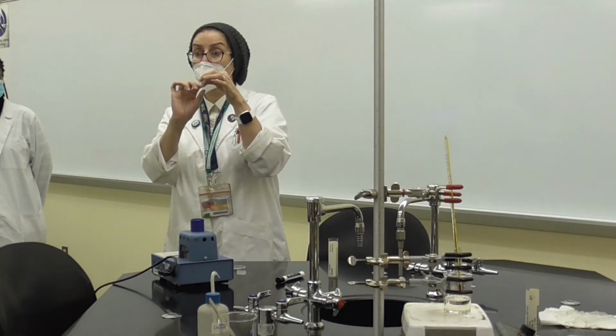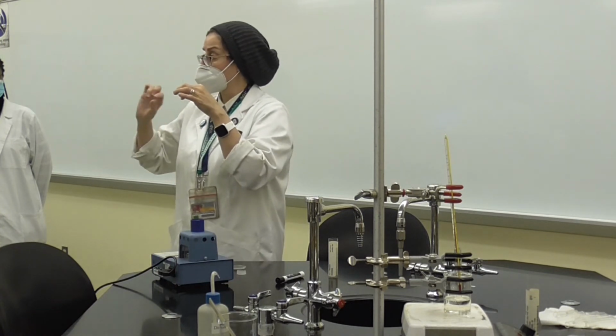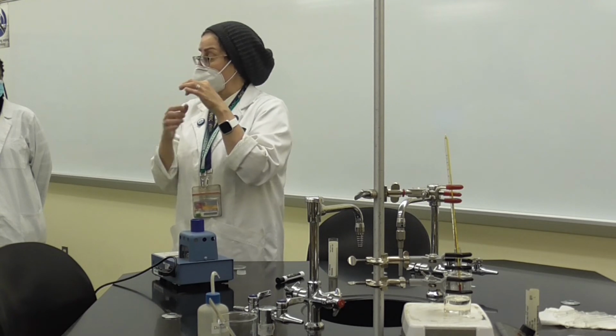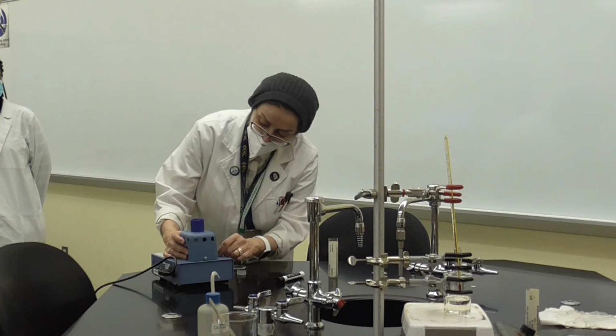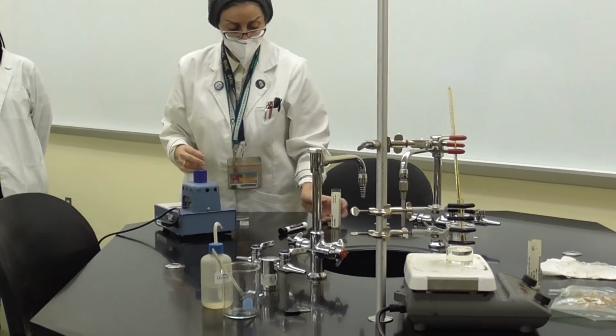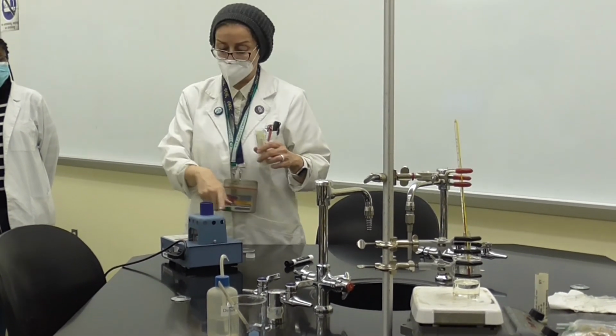You don't want it too high. In other words, you don't pack it with more than 1 or 2 millimeters of the powder. And then we are going to insert it here. There are 2 compartments, so you can prepare 2 capillary tubes and read them at a time.